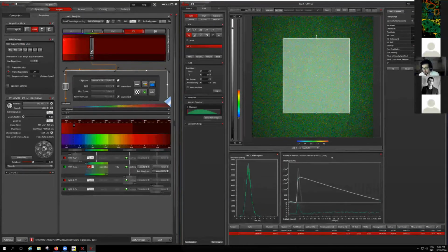In principle, we have a higher chance for optical aberrations as well when we go to the side of the field of view when we are imaging. So when we are using the optics, and also using the zoom, we will see later how that works.